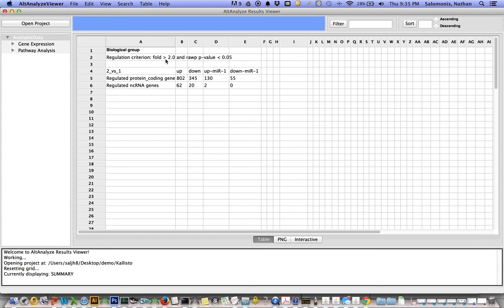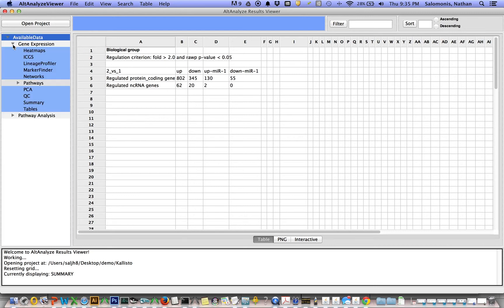Again, fold greater than two, raw p less than 0.05. We used a raw p because these were just n equals two for this preliminary analysis. If you click under here in this arrow under gene expression, you'll see all these additional result files you can look at.